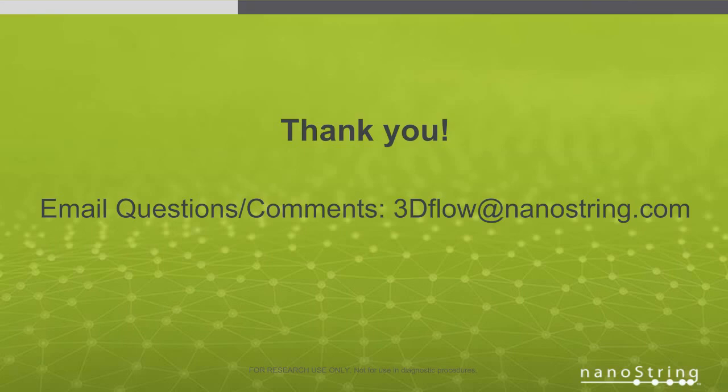Thank you, and I want to thank our audience members for our wonderful questions coming in. Do flow cytometry and nanostring antibodies block each other? So that's also a good question, and it's certainly possible that they can. This gets at the 3D flow application, where we're staying with the fluorescently labeled antibodies we need for sorting and the DNA labeled antibodies for quantitation on our platform. So we always check that. We recommend to our customers that they check it before they start a study, particularly if they're working with fluorescent antibodies that are different than what others have used.